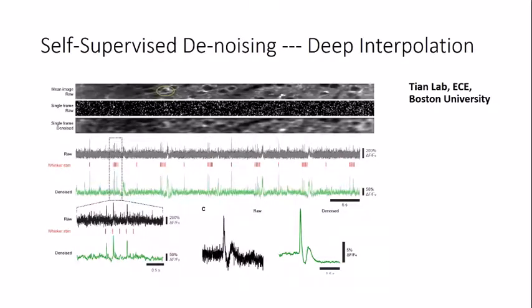One thing that I need to mention. This is a behavior experiment that we performed on mice, where the stimulus that we're using here is shown in red. So we just put an air puff to the mouse whiskers, to generate a more global stimulus while we're looking at somatosensory cortex. So it's just air puffs, 15 and 15 interleaving.